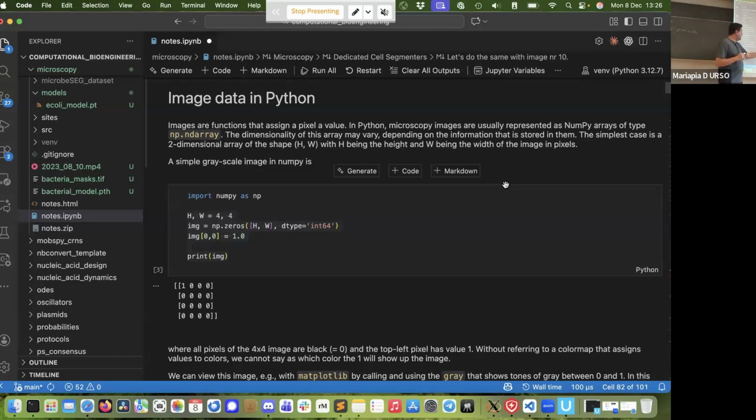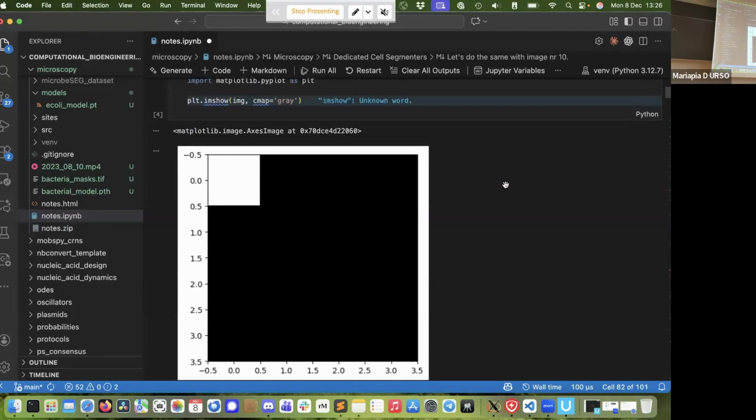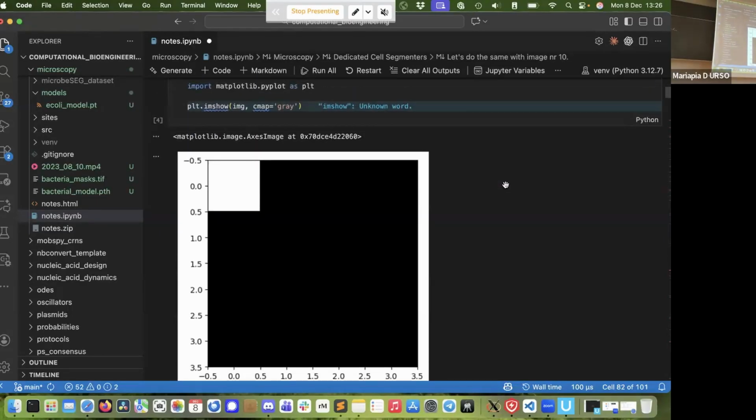So this is really the image, how you will see it, as the lines, right? And with the usual libraries that you like for plotting, for example matplotlib, you can view such an image. This is how you can view an image. You just call imshow, and it shows you this image here.